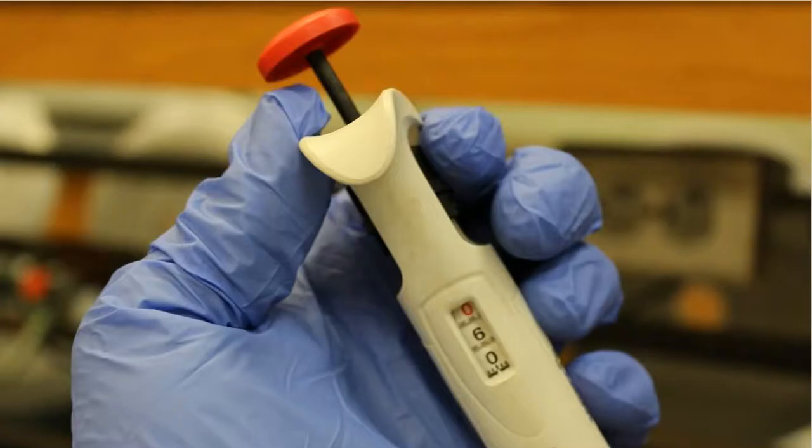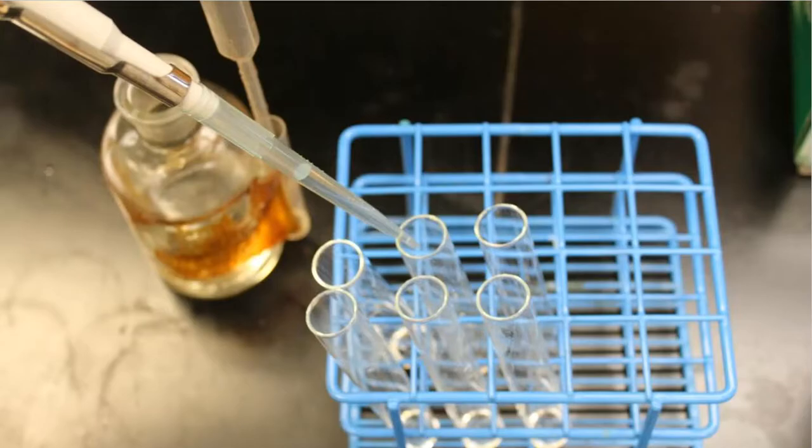Now I'm going to go back to my micropipetter, and this time I dial it into 0.60, which basically means 600. And 600 microliters is equal to 0.6 milliliters. Do the conversion if you don't believe me. I promise it's true. All right, so in the other 3 test tubes, I'm going to put sulfuric, sulfuric, and sulfuric on the inside. So now I have 3 sets. Nitric sulfuric, nitric sulfuric, and nitric and sulfuric.